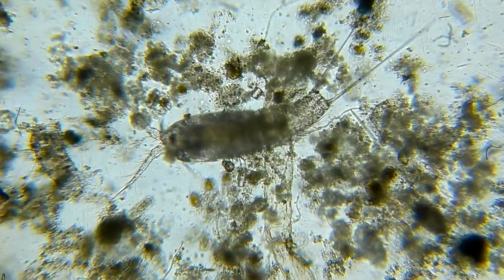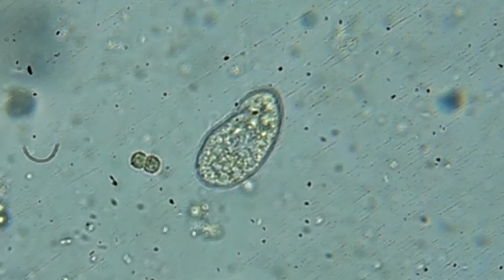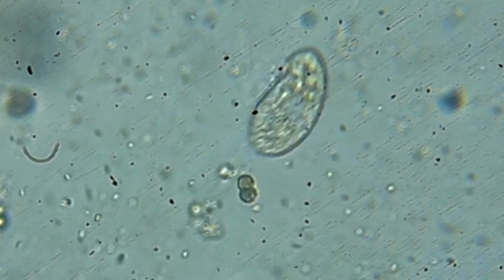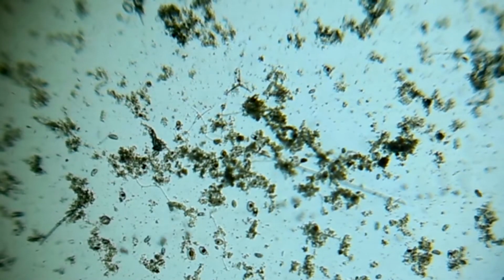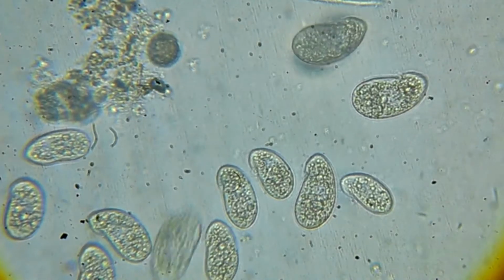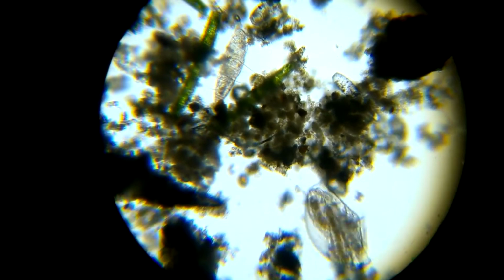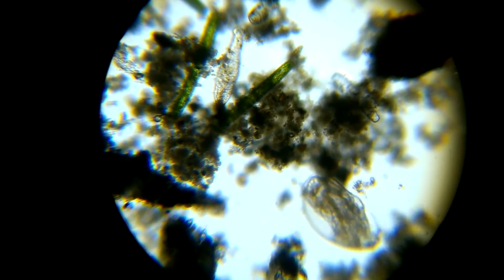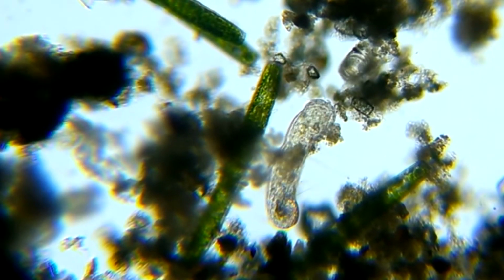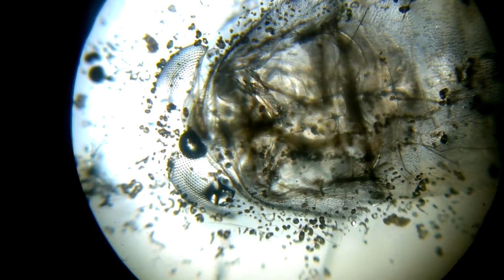Like, what's that guy doing? It's like a balloon on a string. Then we got plankton. I don't know, like a tornado bean. And yeah, I just think all this stuff's super interesting, and I wanted to reach out and find someone. So if you know someone who would be able to help me identify some of these critters, or might point me in the right direction, that'd be super cool.